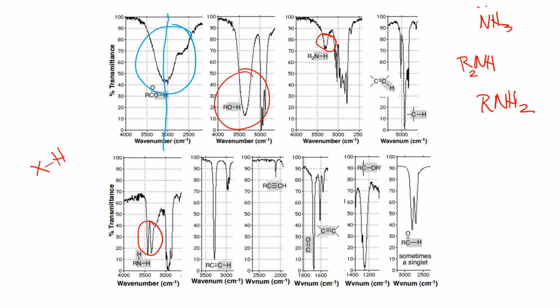Now, the other bands that we see here are hydrogens attached to different types of carbon. This one right here, just under 3000, we're going to be looking at as carbon sp3 hydrogen. So right under, that's why I say that we want to be drawing the line right on the 3000. Well, that's not straight, but you can imagine that. So right under is carbon sp3. Right above here is a carbon sp2. Those are shapes that we want to know. And this is even higher. This is your carbon sp.